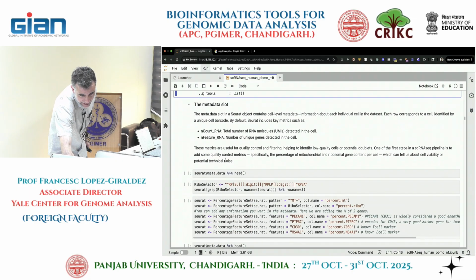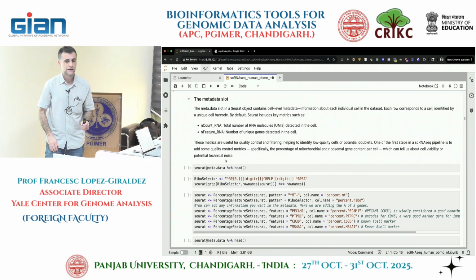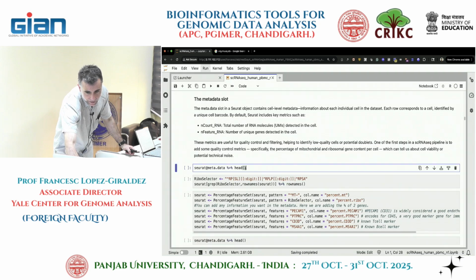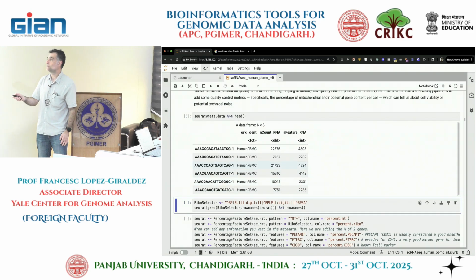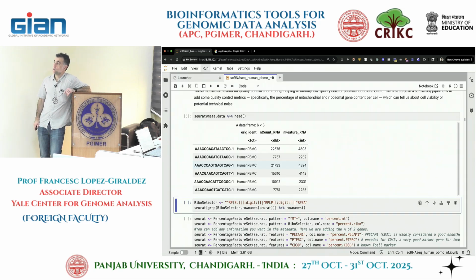One important section of the Seurat object is the metadata. Similarly to the metadata we have for bulk RNA-seq, there is a metadata table inside of the Seurat object. So, you know how to visualize it, right? We talk about visualizing, visualizing, and visualizing. So to access it, for example, we use this add symbol, and we say, go to the metadata table. You can go to different tables inside of the Seurat object, but we want the metadata, and we're going to print the first six rows. So what do we have here?